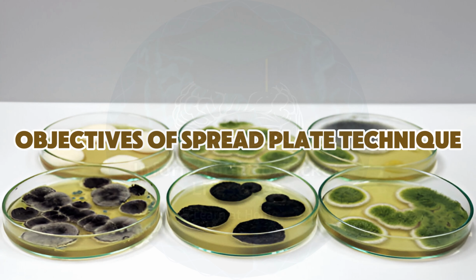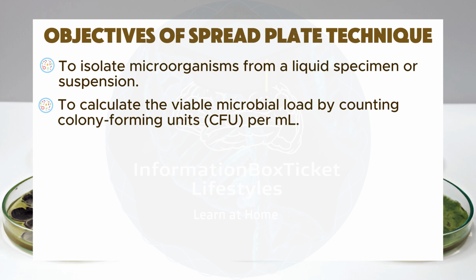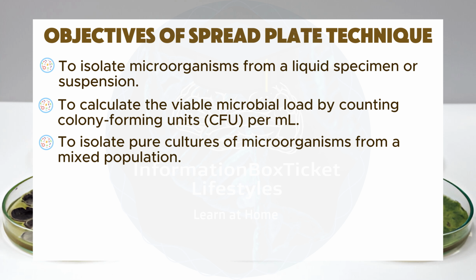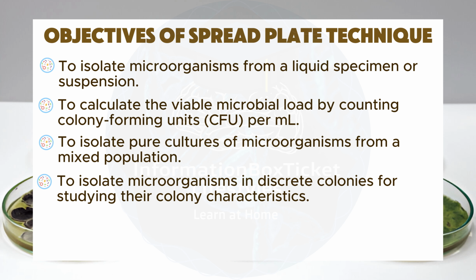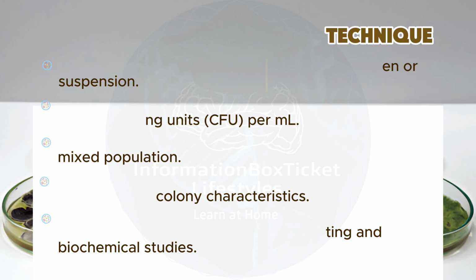Objectives of spread plate technique: to isolate microorganisms from a liquid specimen or suspension, to calculate the viable microbial load by counting colony-forming units per ml, to isolate pure cultures of microorganisms from a mixed population, to isolate microorganisms in discrete colonies for studying their colony characteristics, to obtain sufficient microbial growth for conducting antimicrobial sensitivity testing and biochemical studies.